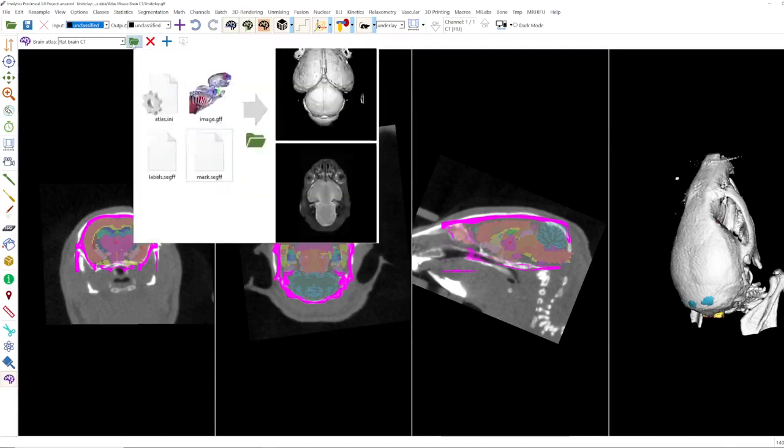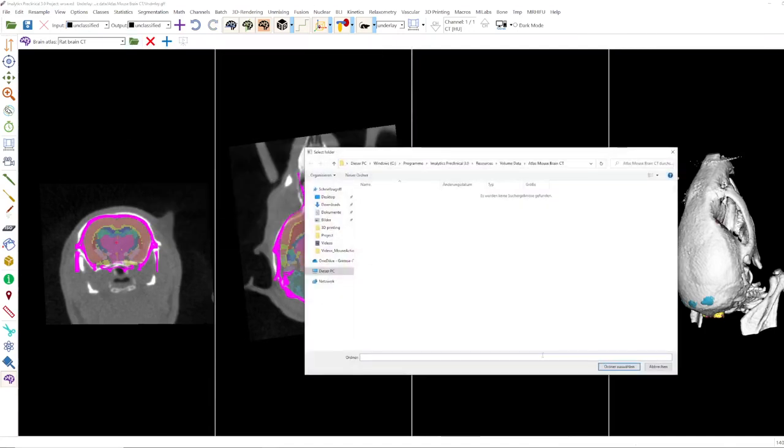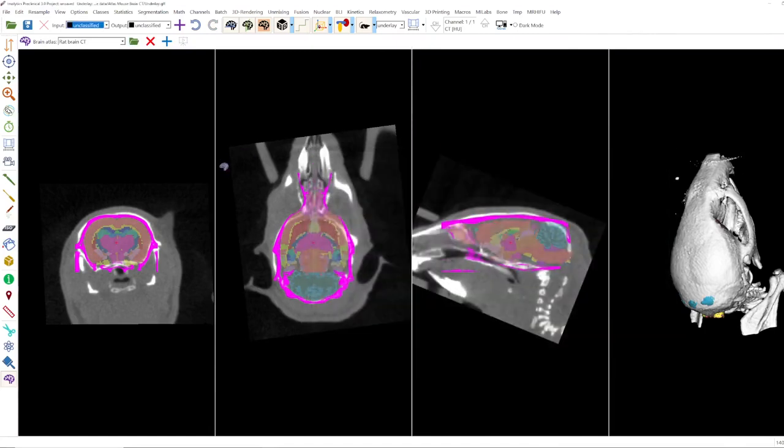With this one you can load your own atlas from reference or library if you established a brain atlas or something else in your institute.